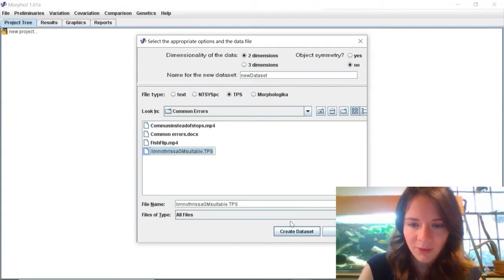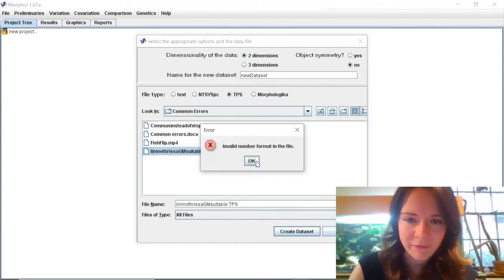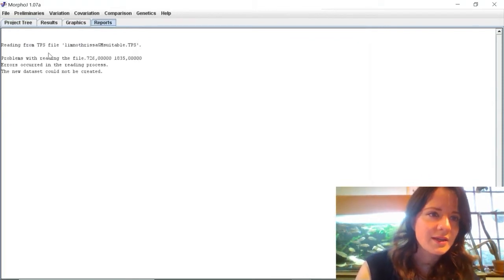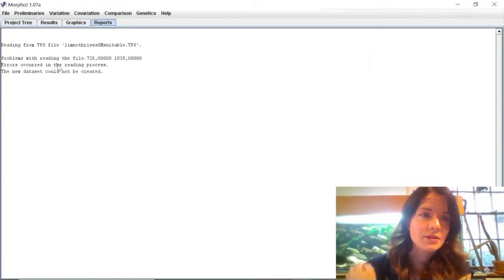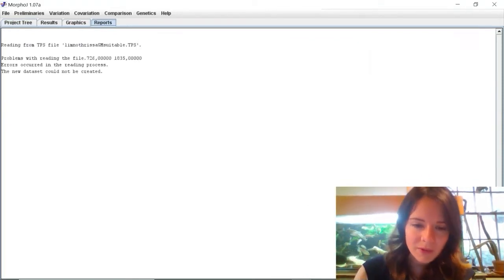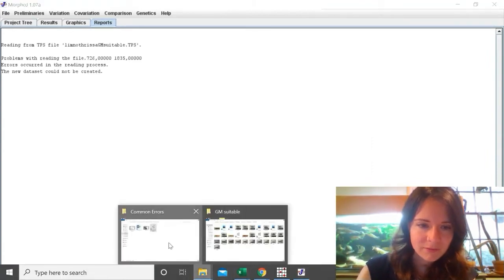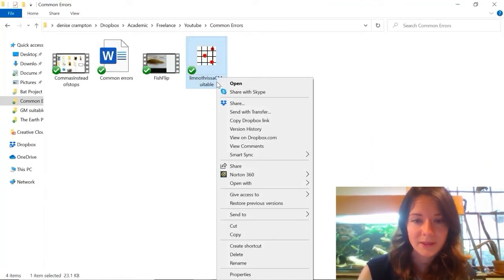So I create my new dataset and it says invalid number format in the file and then it says problems with reading the file.